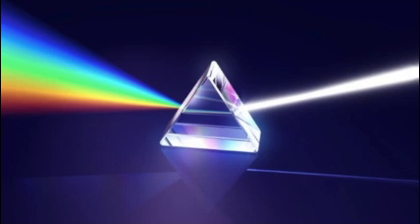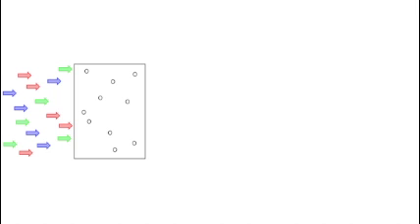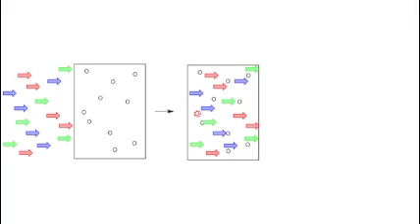Each color has a different amount of energy it can confer. Individual photons will have one specific color, quantified by the wavelength, and energy level. So photons can be blue or green or yellow, which are all specific wavelengths, but you could not have a white photon. Different kinds of molecules have different energy needs. A molecule is very specific about the amount of energy that will get it excited. If the energy is too much or too little, the molecule doesn't accept it. In this picture, the molecules want to absorb red, so while the red photons pass through the solution, those that come into contact with molecules will be absorbed, while all the blue and green photons travel straight through the solution.